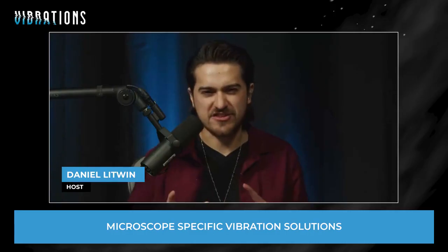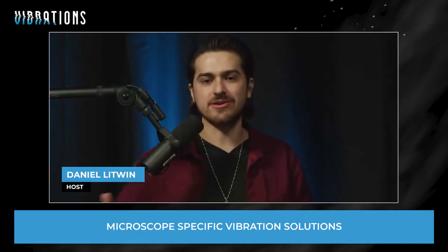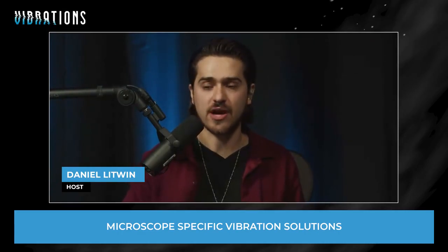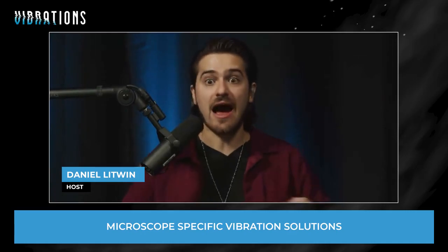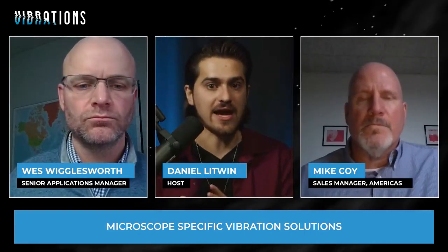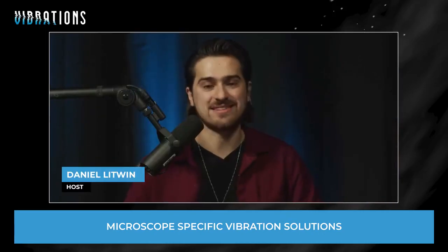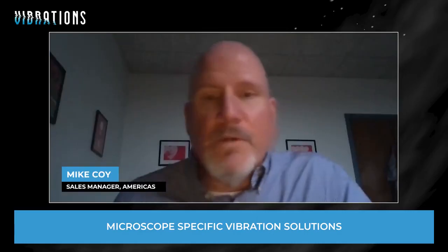Okay, now let's flip this scenario a little bit. I'll step into the shoes of a research operation or a manufacturing operation for semiconductors, whatever it might be. I already have a microscope. It's already being used. How would I know if my work is already being impacted by vibration that I haven't controlled yet, that I have not mitigated or accounted for? Where do you start if you've already started? You already have a site and it's operational, but maybe there's vibration you have not investigated, drawn data on, and come up with a solution for? Yeah, great question.